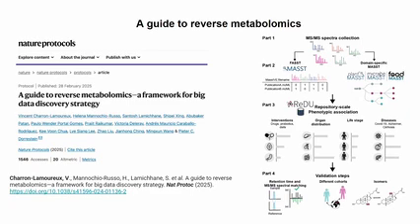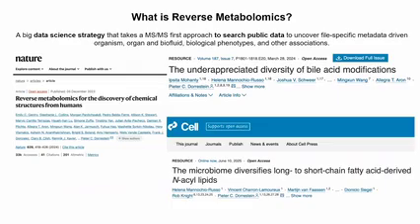And reverse metabolomics is four different parts. In the first part, you start with an MSMS spectrum. You perform MASST, so it's going to search in the public domain where this MSMS is found. You're going to associate and integrate metadata to it. Yasin will tackle that part. And then part 4 is the validation step. We're not going to talk about the validation step today, and the reason is this step is dependent on your research question. So we are not going to address that today, but you're welcome to talk with us about it if you're interested.